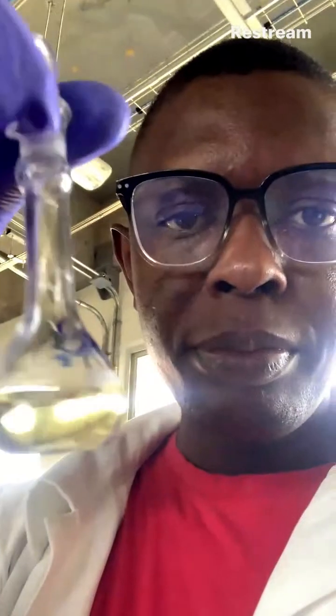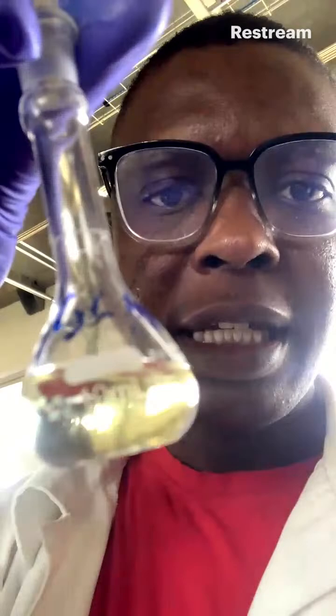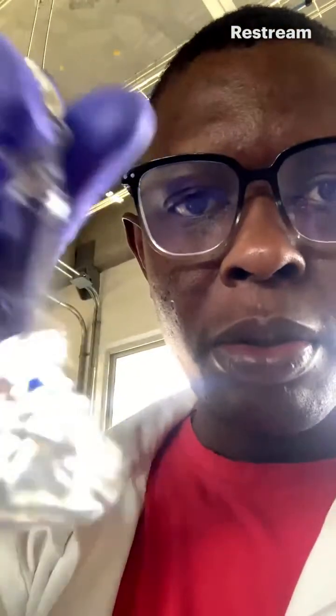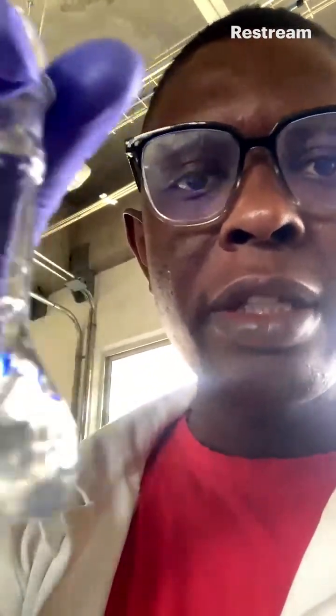Alright, so guys, I'm done preparing my samples. If you want to watch the process, you can go from the beginning of the live section. You can play it and you will see how I was able to make my sample. This is glycerol carbonate using agave as a catalyst. This is glycerol carbonate using sodium aluminate. So I use isopropanol as my solvent and I diluted it to 5 ml.